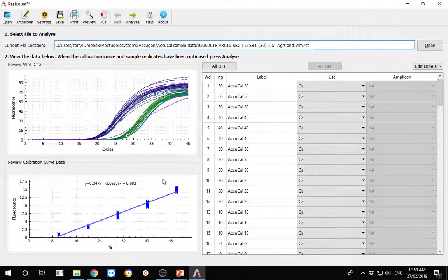The left middle section shows the amplification of your genes. The software uses this to calculate efficiencies from the window of linearity. And the top and the right is where you can configure the settings. A more detailed tutorial can be found online for configuring these.